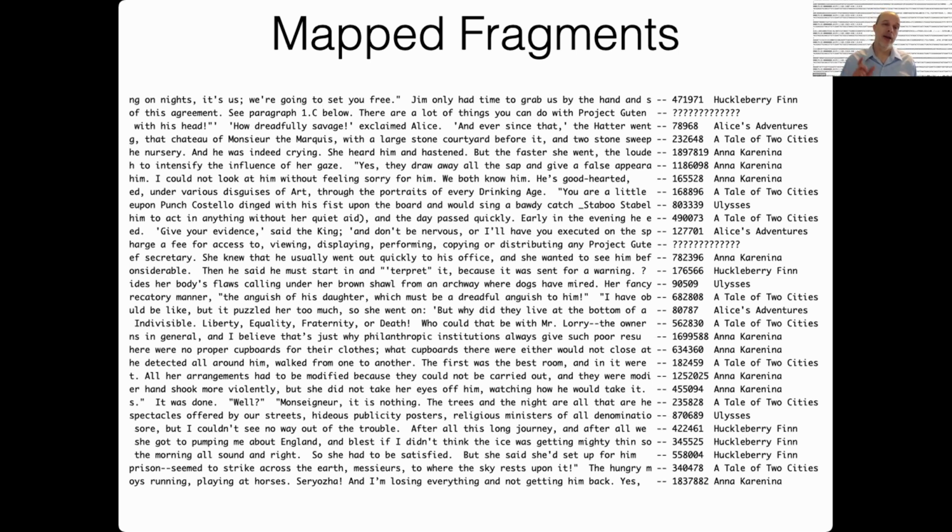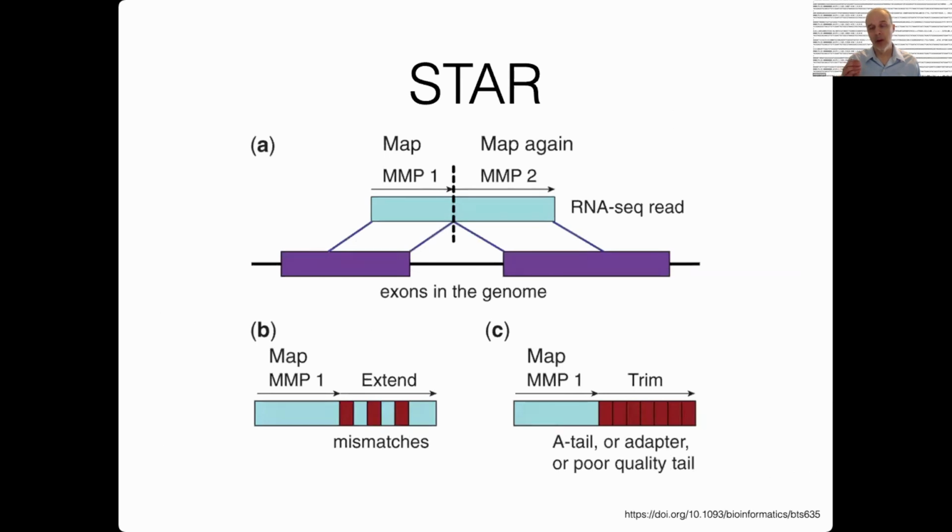We are using an RNA-seq specific method because there's a little bit of added complexity that makes it so that software that's not specific for RNA-seq data will not do as well as software that's specific for RNA-seq data. And I just want to show you the 2 major special cases that STAR handles, that software that's really designed for DNA data isn't going to handle, and so it's just going to not perform as well.